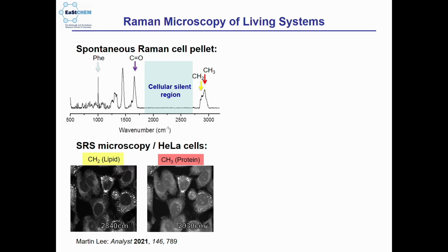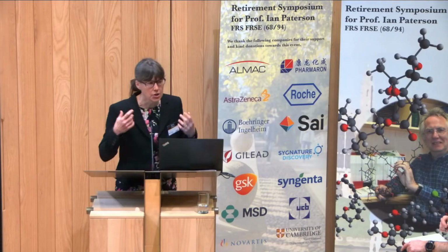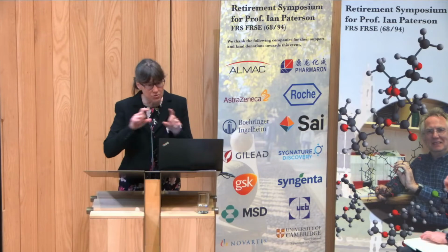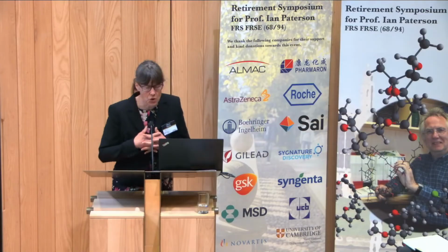So what I'm going to tell you about now is what you can do. If you grow cells, you spin them down, you put them on a microscope slide, you can just record a spectrum of the cell, okay? And that's what the spontaneous spectrum at the top is there.